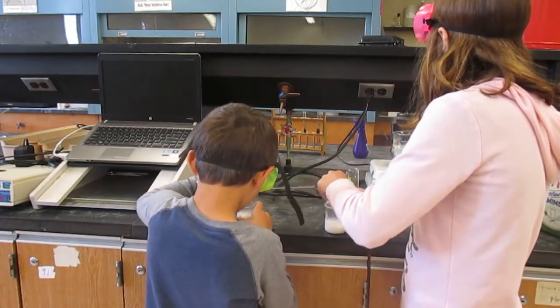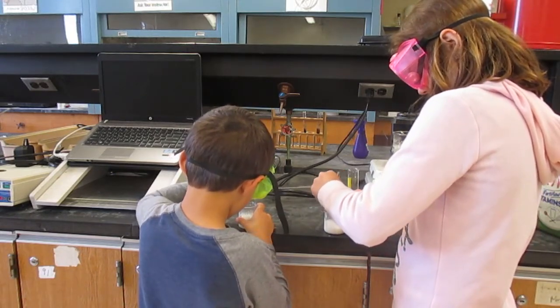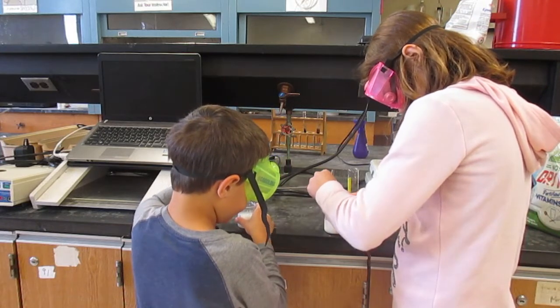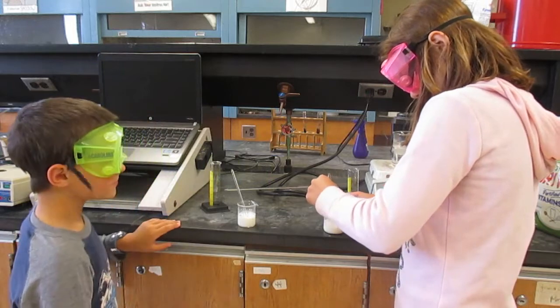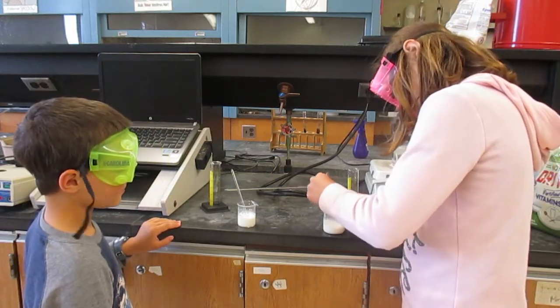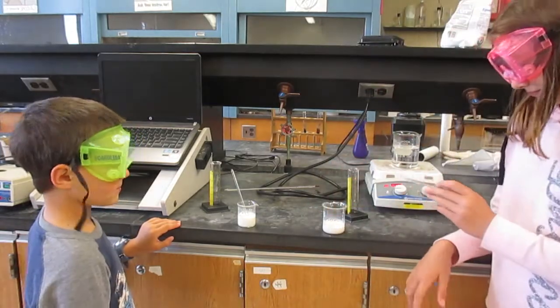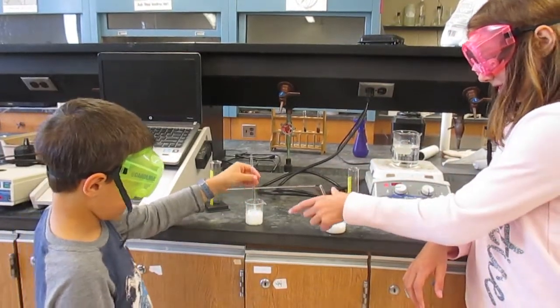So how would you know if it's all dissolved? Do you feel any powder down there? You wouldn't feel any powder. That's right. All the powder would dissolve. I don't feel any powder. Okay. So you, Josiah, you don't feel any powder. And do you, Ezreal? Nope. All right. So I think we have dissolved our non-fat dry milk.